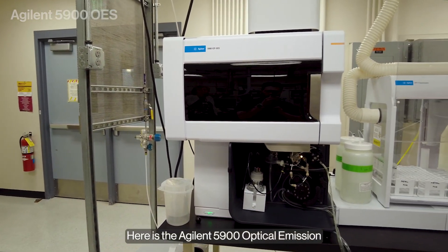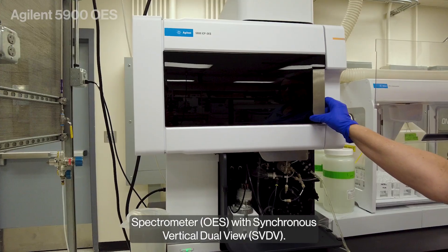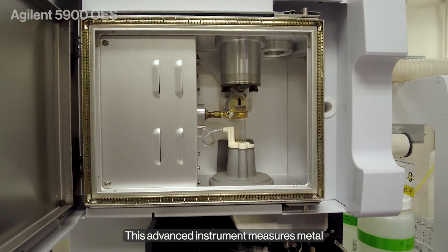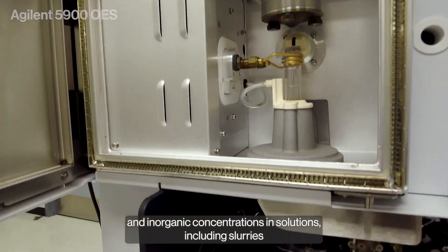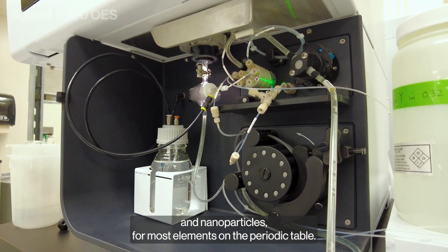Here is the Agilent 5900 optical emission spectrometer with synchronous vertical dual view. This advanced instrument measures metal and inorganic concentrations in solutions, including slurries and nanoparticles, for most elements on the periodic table.